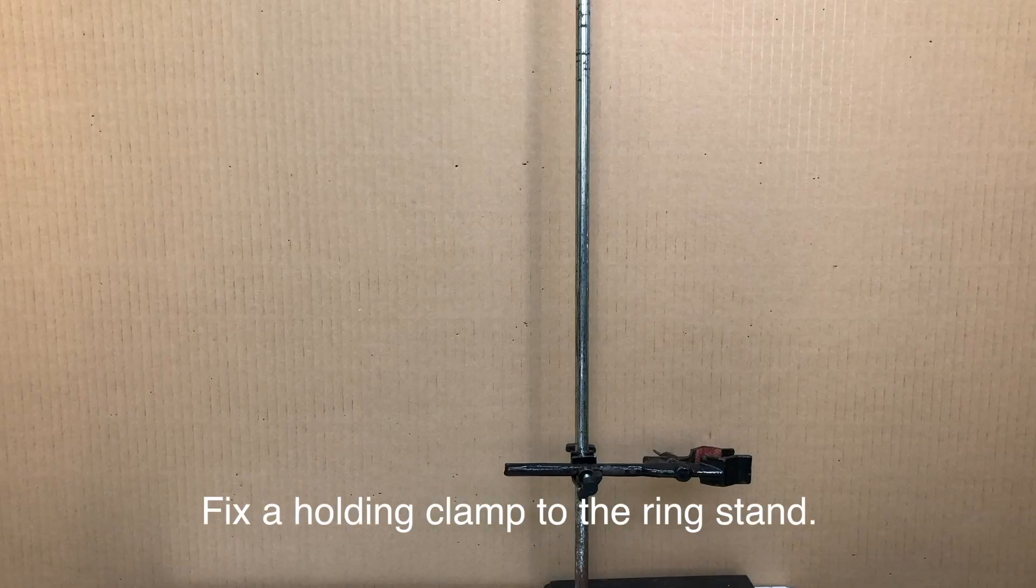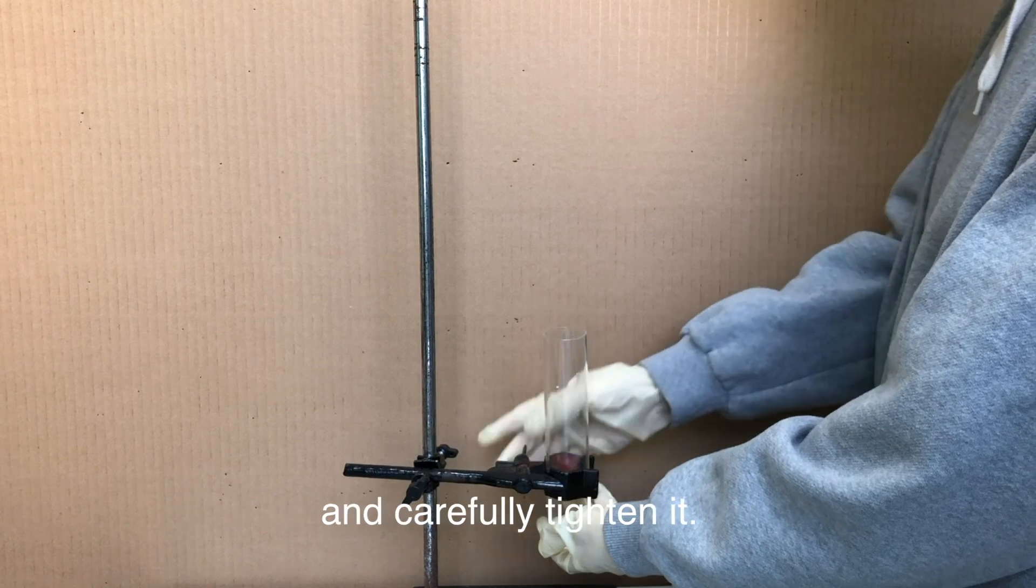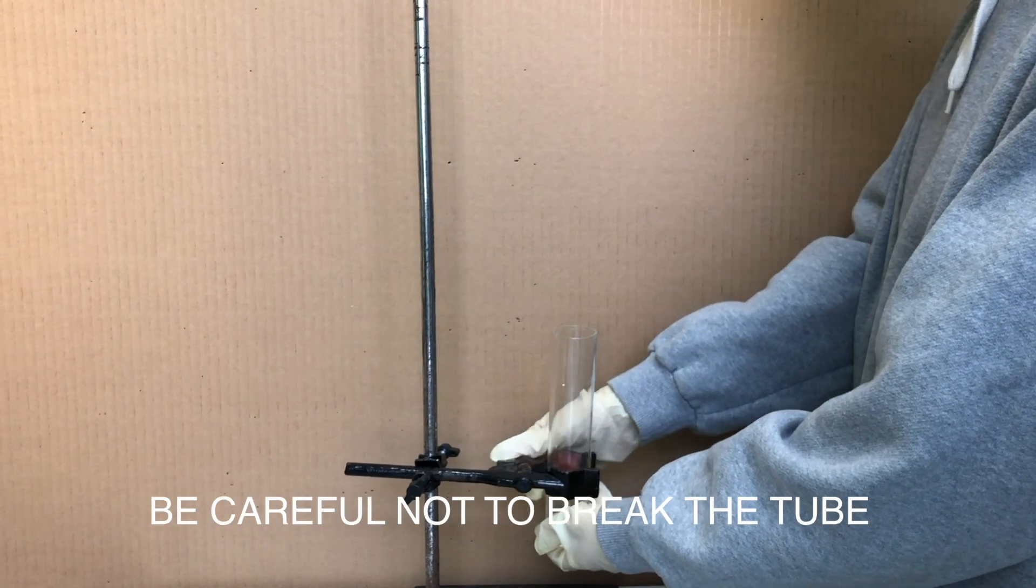Part two: experimental setup. Fix a holding clamp to the ring stand. Place the glass tube chamber in the clamp and carefully tighten it. Be careful not to break the tube.